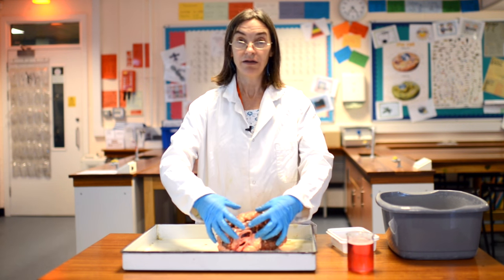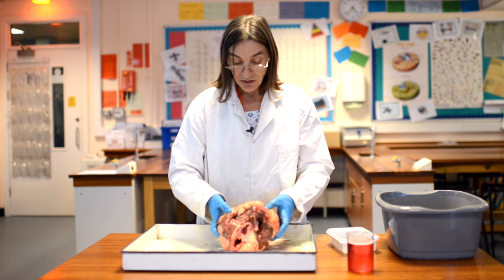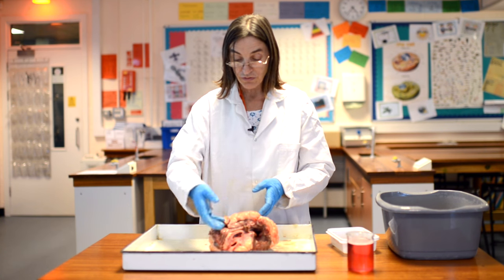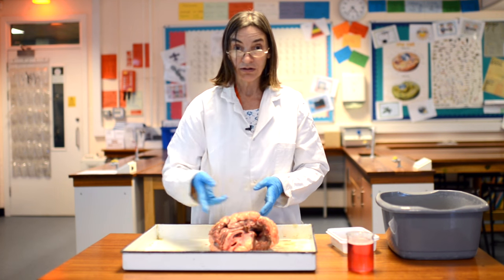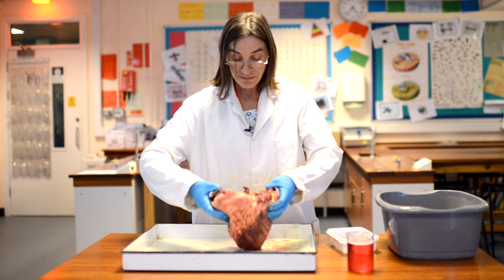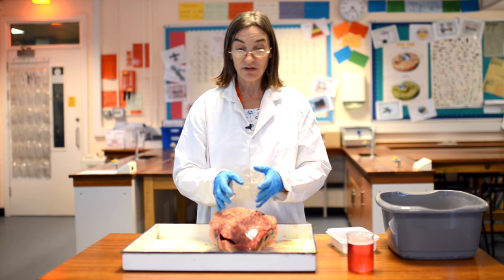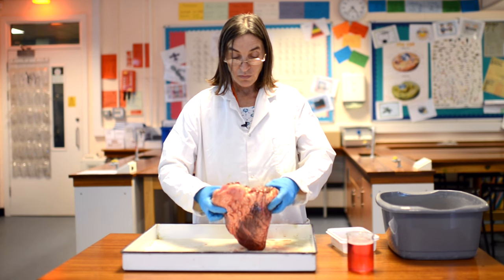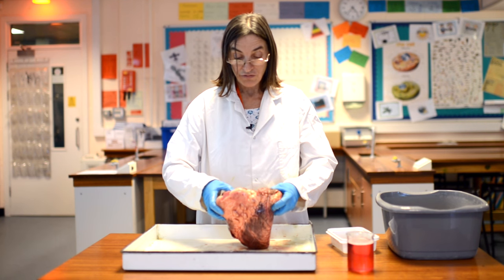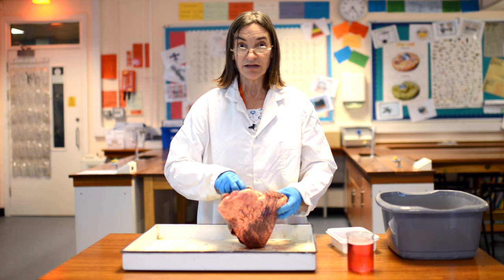This is the top of the heart. Mammals like the ox and like us have a double circulation. The blood's going to go through the heart twice in one complete circulation to the body. So if I just turn him back towards me, so now I've got him in the position that he is in the body, what actually happens is that the blood will come from the body and go first into the right-hand side of the heart.